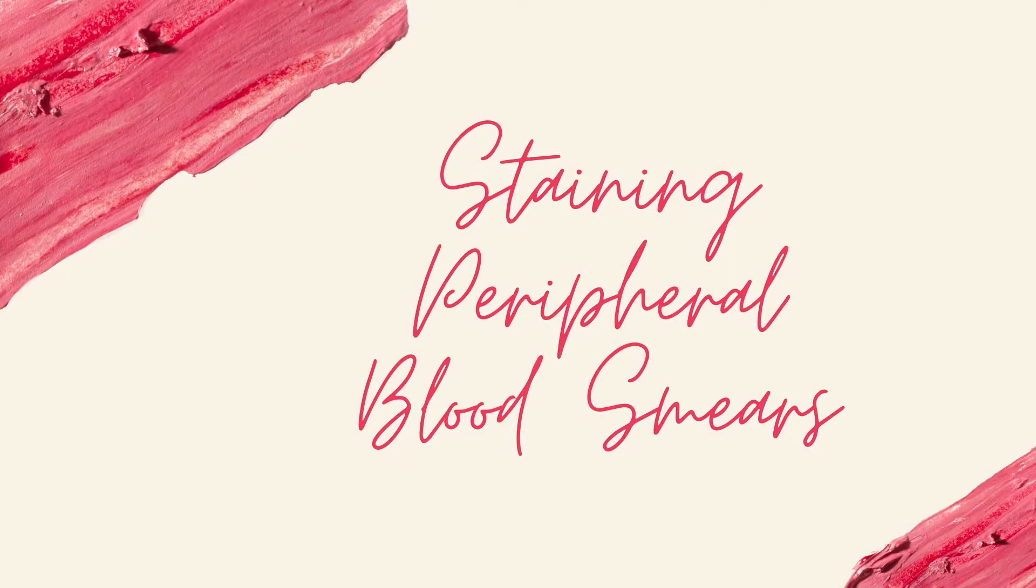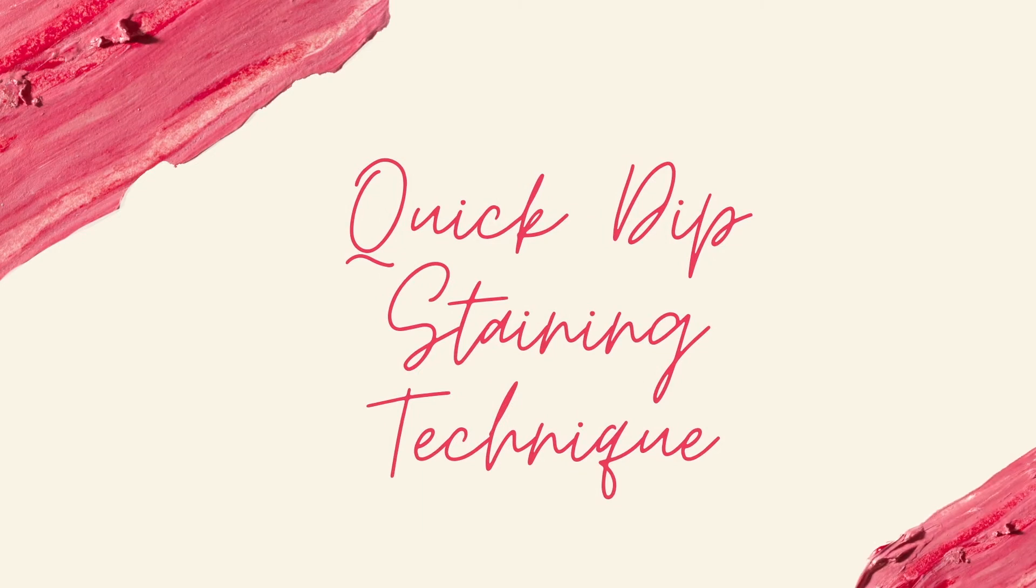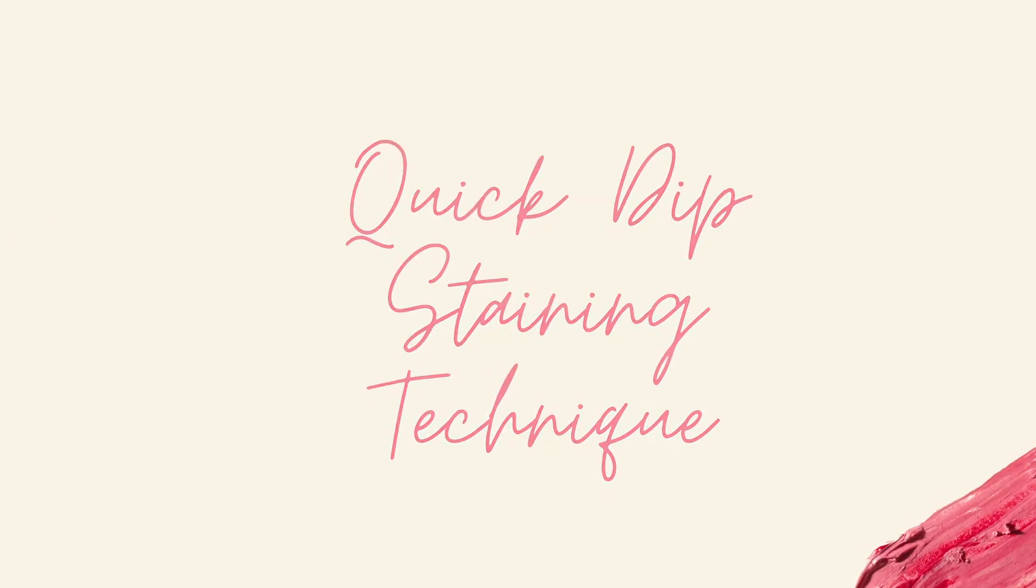Hello everybody! Today we will be learning about how to stain peripheral smears. Here's how to do the quick dip staining technique.